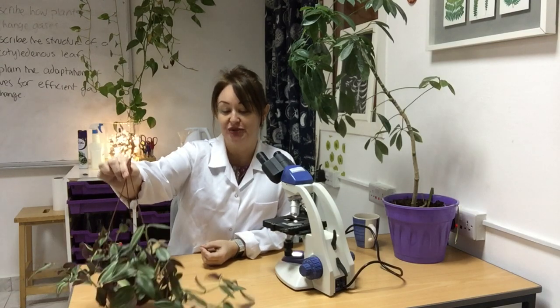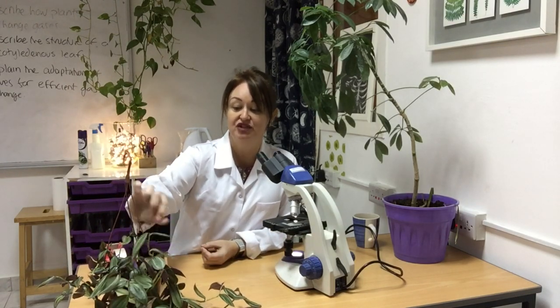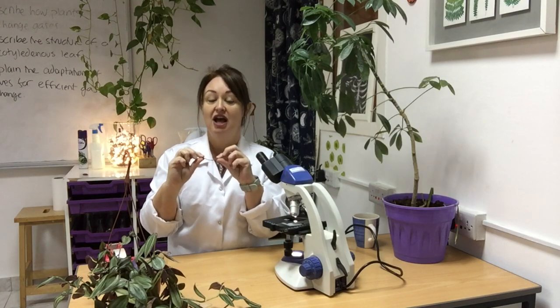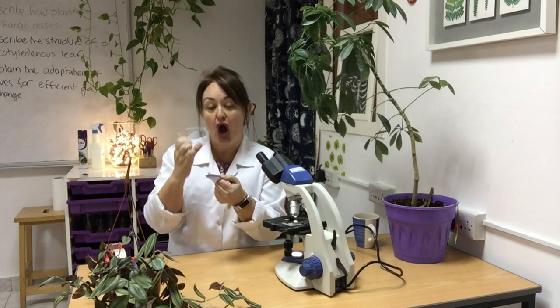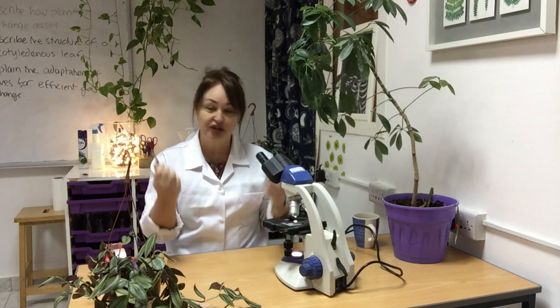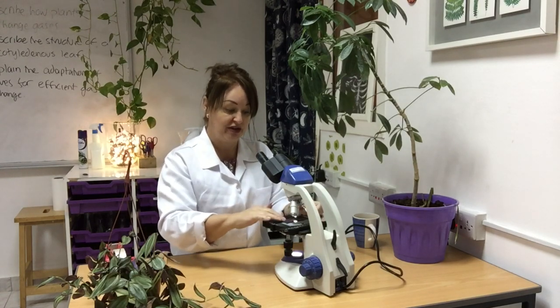This is a fabulous plant to use — it's called Tradescantia — and why it's so good is because the leaves are green on the top and purple on the bottom. If I remove one and look at the underside, which is where we find the stomata, the guard cells appear green against a purple background. Because of that they're really easy to identify, so no specialist techniques are needed — we can literally just put that on the microscope.